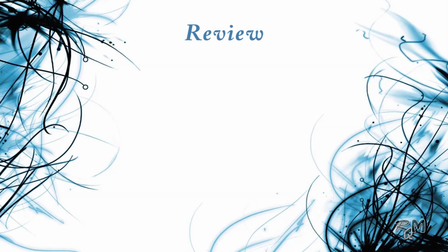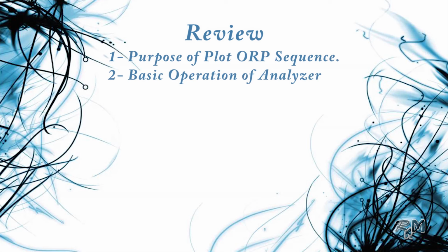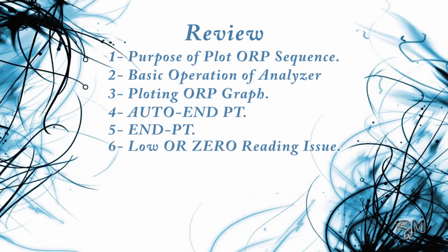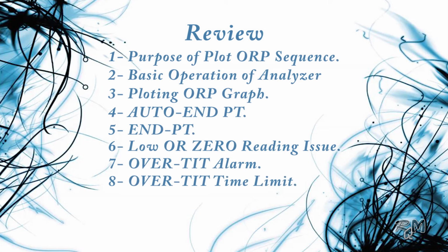Okay guys, in this part we discussed the purpose of plot ORP sequence, basic operation of the analyzer, plotting the ORP graph, auto endpoint, and two types of issues, low or zero reading issue and over titration alarm, and the purpose of the over titration time limit parameter.